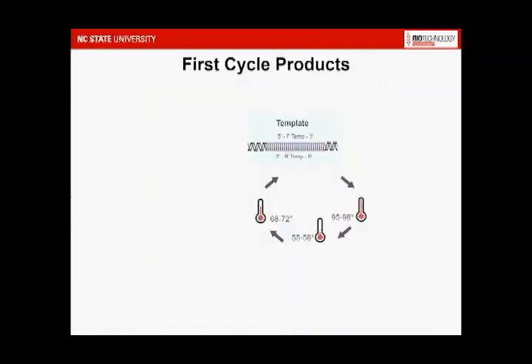Now that we understand a typical PCR cycle, it's important to note that the first few cycles in the chain reaction are a little bit different. In the very first cycle of PCR, the original template is usually not the amplified PCR product, and instead a much longer piece of double-stranded DNA. This long template is denatured to form two long single-stranded templates.